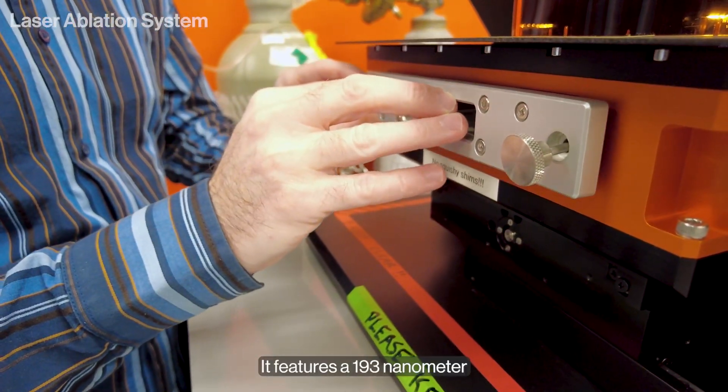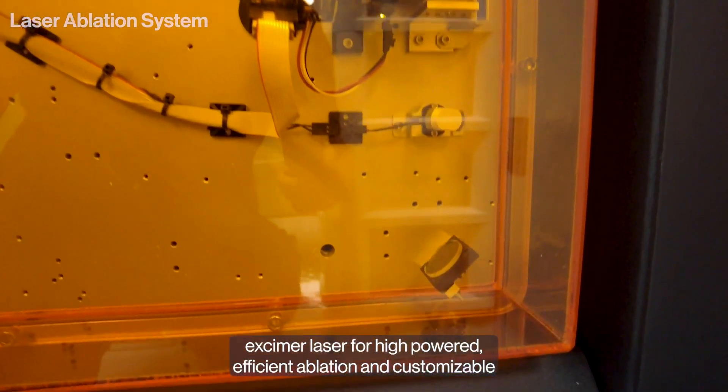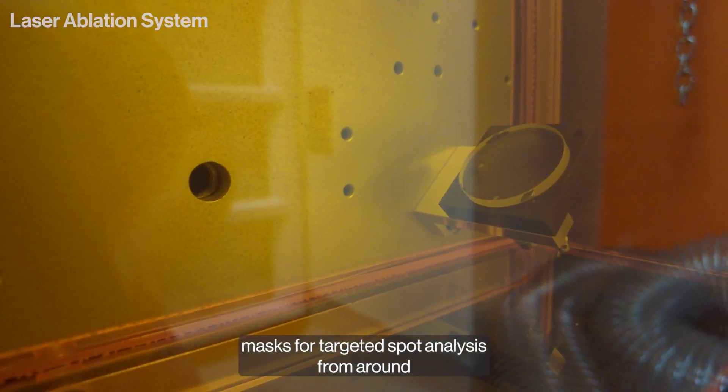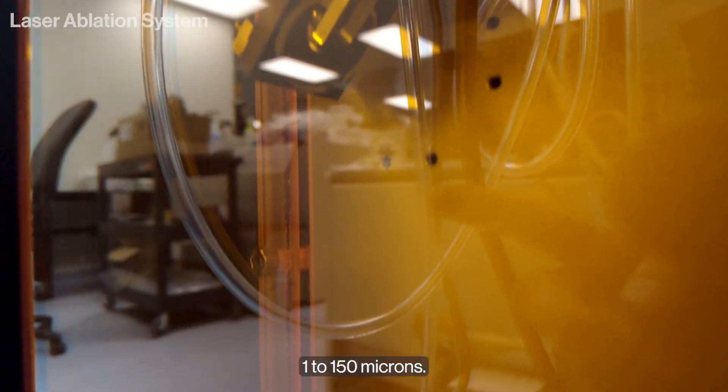It features a 193-nanometer excimer laser for high-powered, efficient ablation and customizable masks for targeted spot analysis from around 1 to 150 microns.